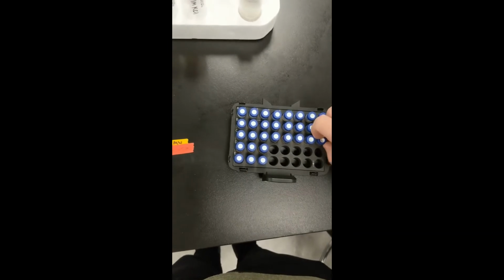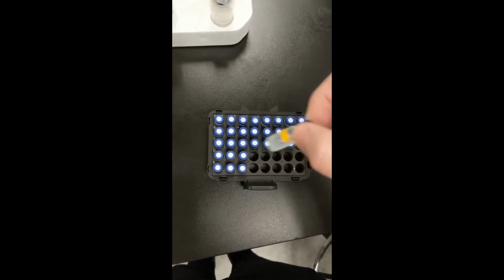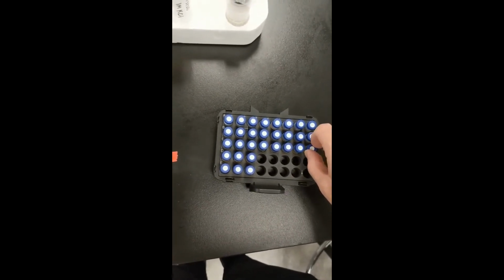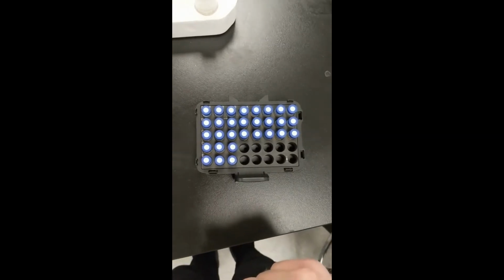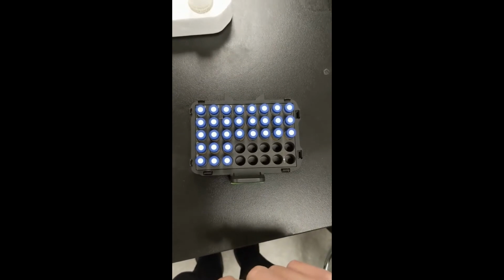And it's actually important to not put tape on your samples. If you put tiny pieces of tape like this, it's fine as long as it's above the top. But normally, this can actually make them get stuck inside the tray, which makes them really annoying to take out. And it's also harder to wash the vials when you have that. So try to avoid that.